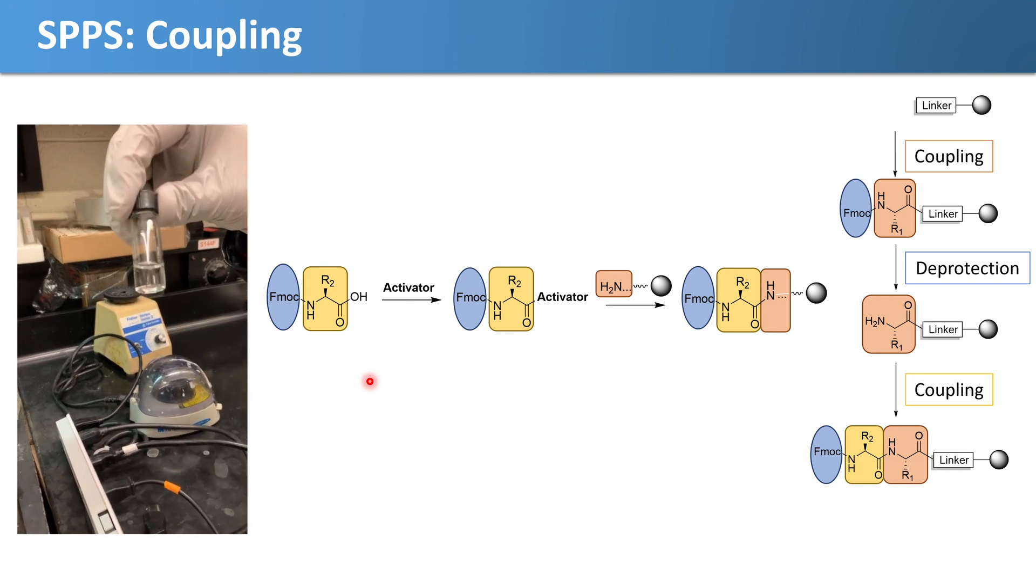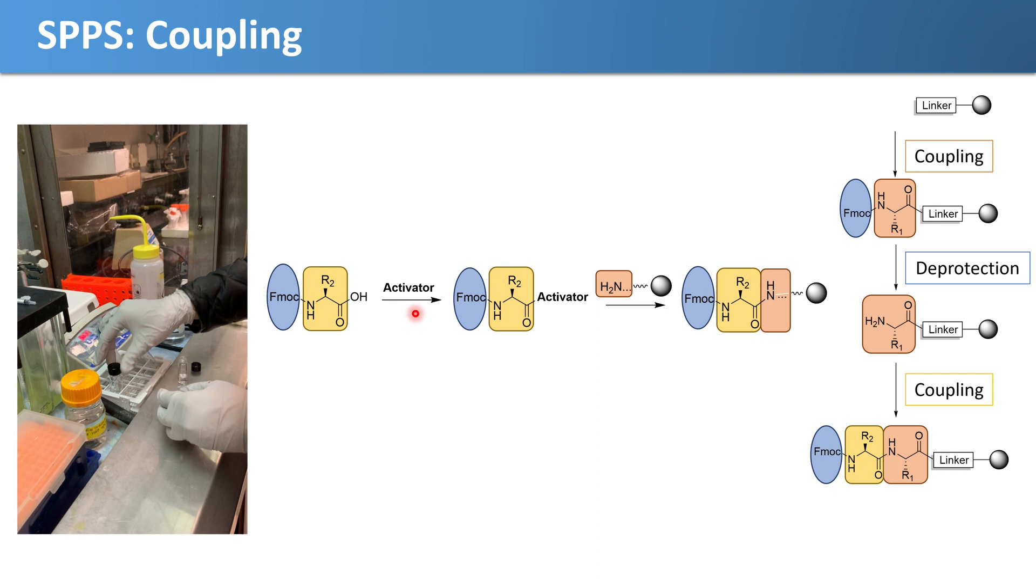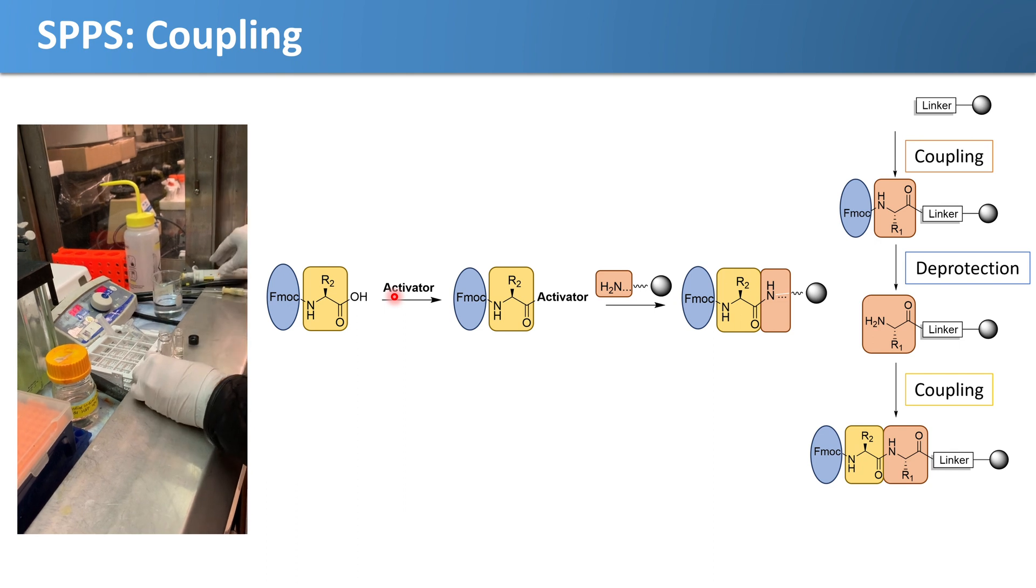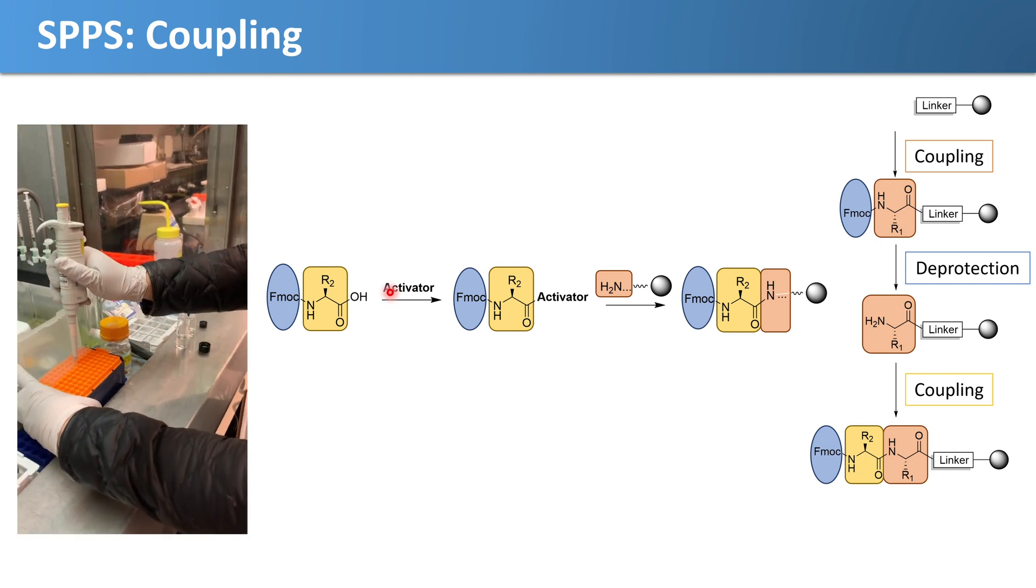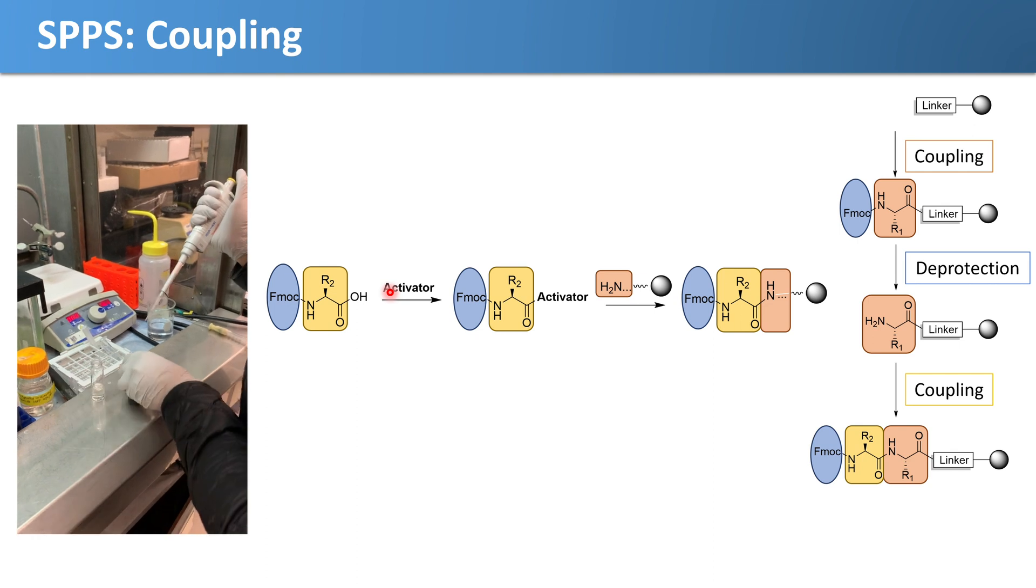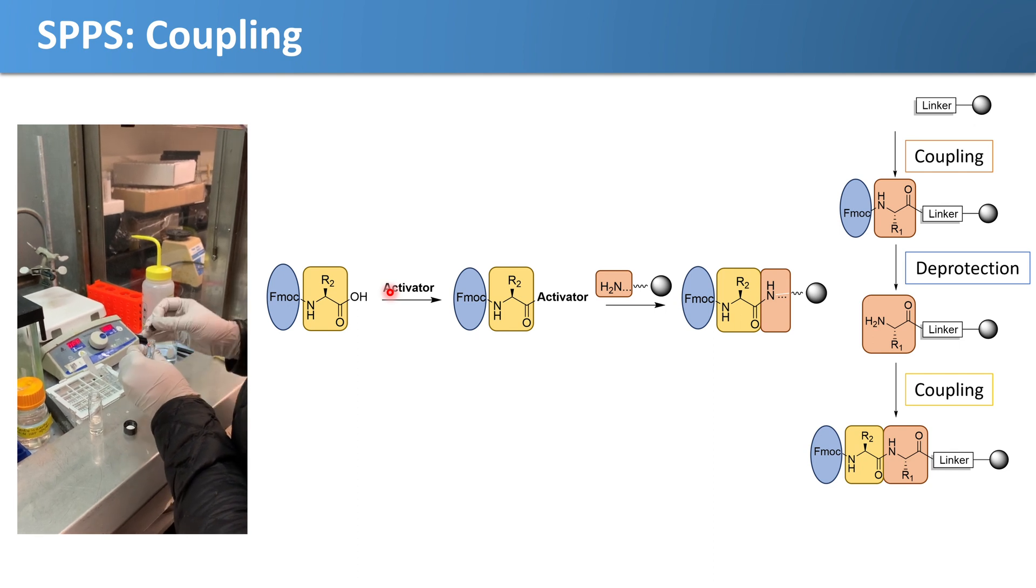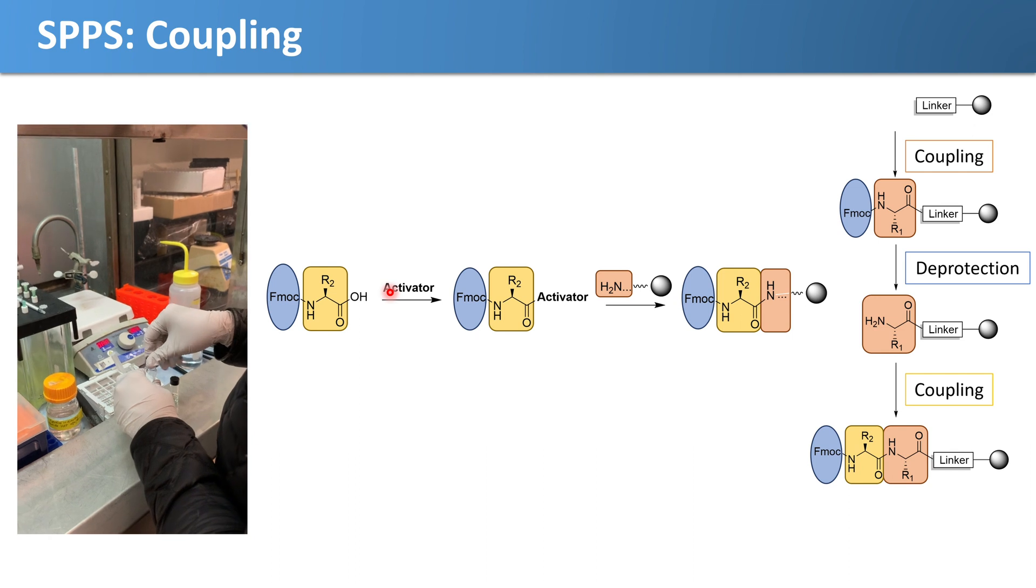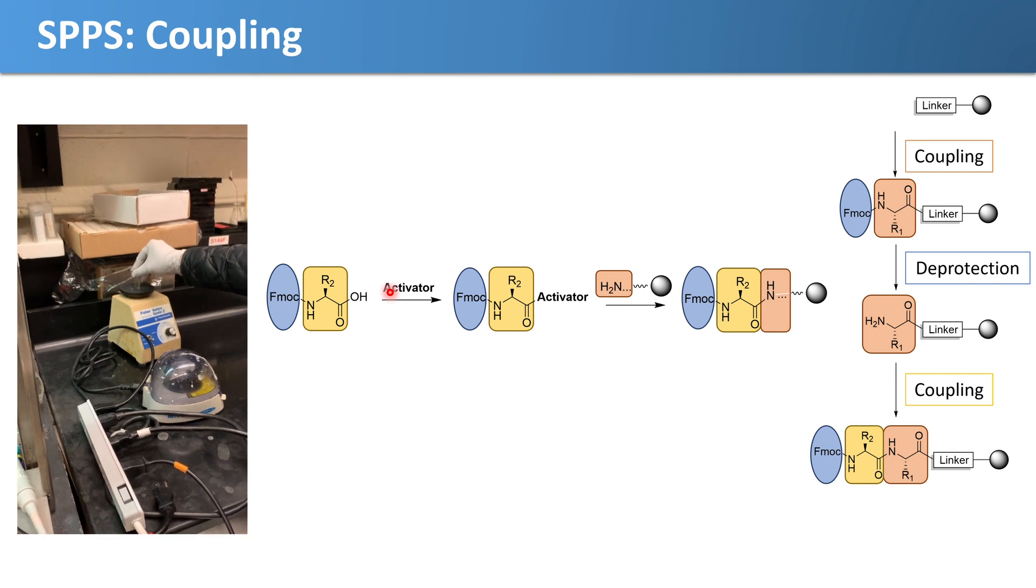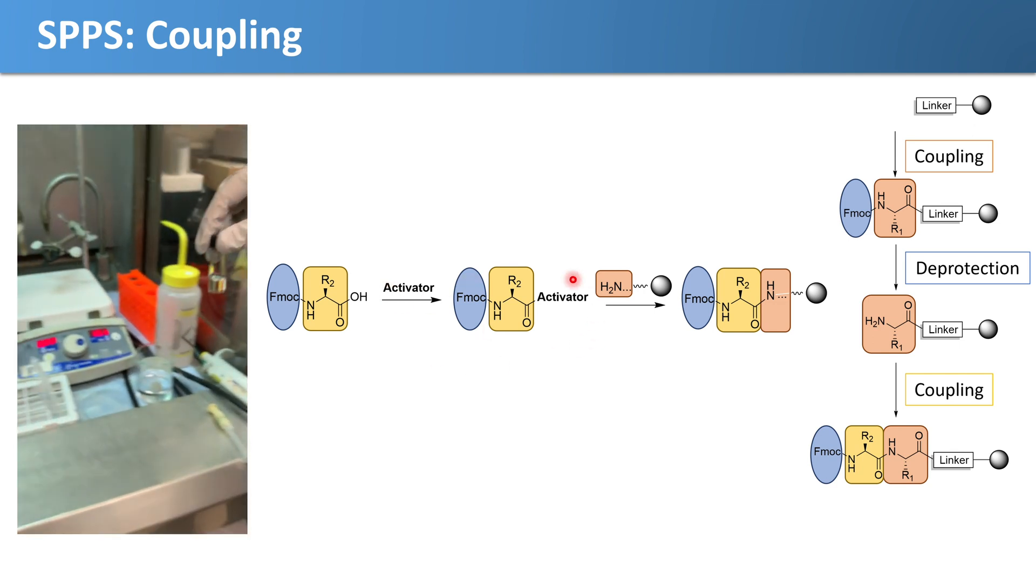The solution is clear, which is because the two have not reacted yet. In order to promote this reaction, we have to add a base. This base is di-P. Then she will mix the two to react. Now you can see it has this faint yellow color, which corresponds to the activated amino acid.